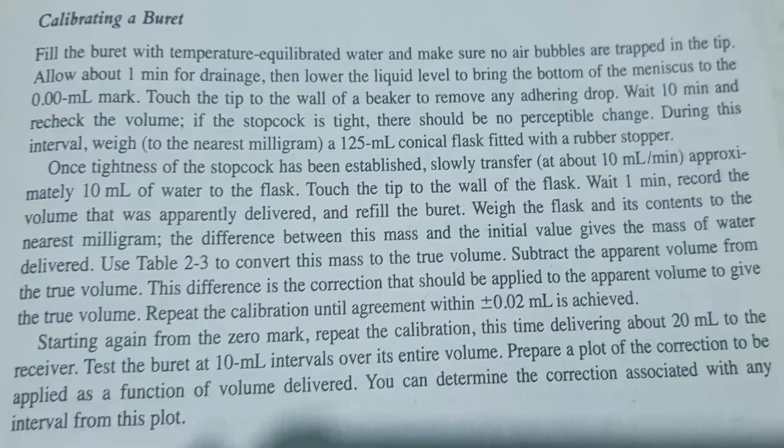And then refill the burette. Add water whose temperature is equilibrated. And then the receiver, the flask, we will weigh again. This time, the flask and then the content. So in the nearest milligram again is what we will use.